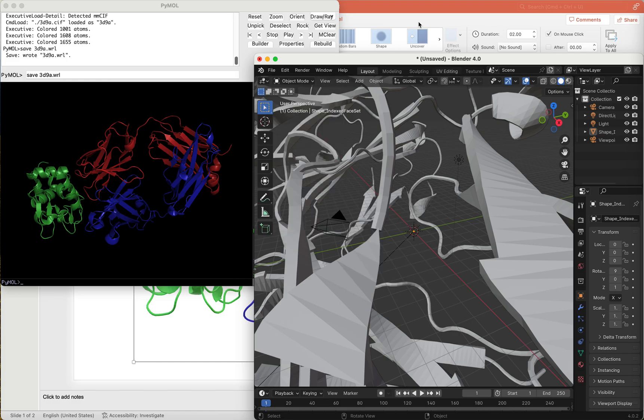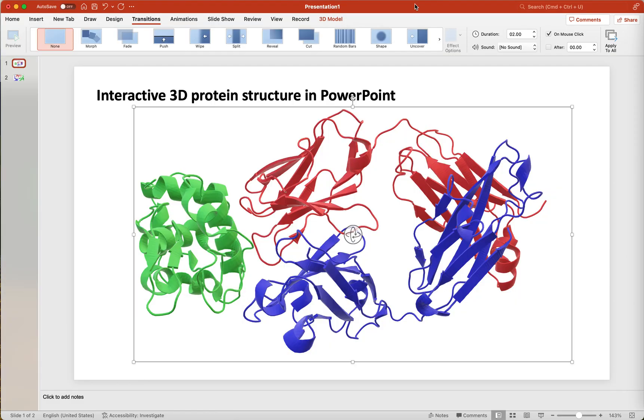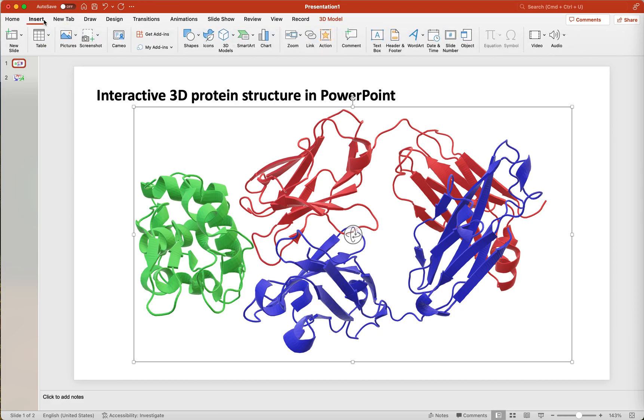This .glb file can then be inserted into your PowerPoint presentation by choosing Insert, 3D Models, This Device, and the filename.